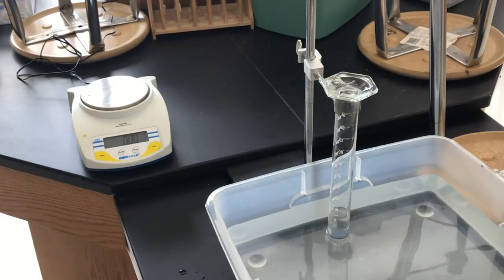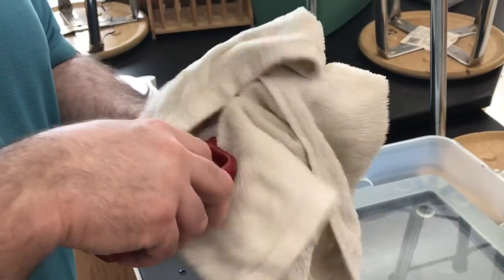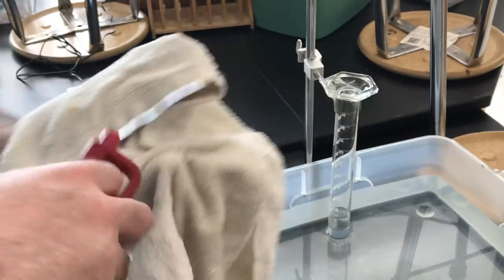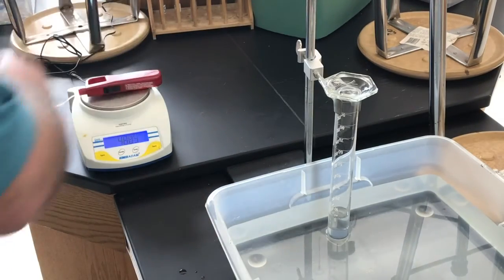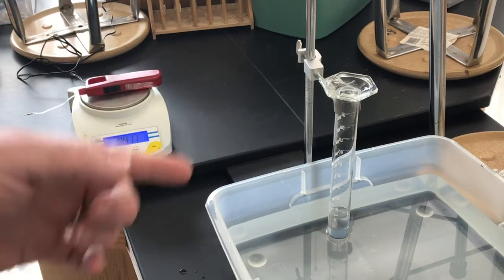Now I am going to dry this off. The hose got a little bit wet, so I don't want to weigh the water if I can avoid it. And now I'm going to weigh this again. And now it is 44.10 grams.